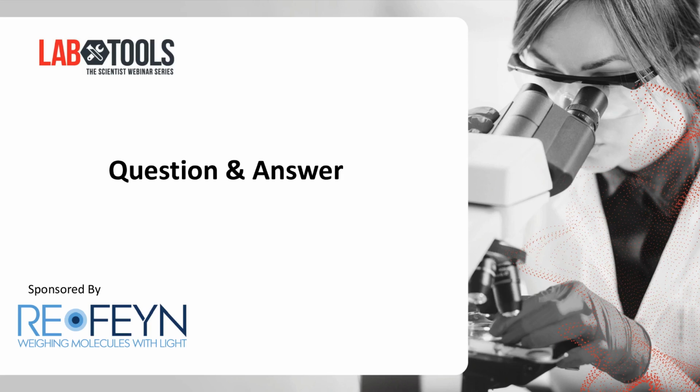Oh, yeah, that's a really excellent question. To be honest, going into this, that's kind of what we expected to happen. But we actually saw no evidence of a large aggregate species. What I didn't have time to mention is that if you look at some of the mass histograms for some of our antibodies, we actually see a small population that's about double the masses that I was describing, and those populations correspond to one or more antibodies binding two spike trimers. But we really didn't see any evidence of large aggregate species, at least in our experimental design. We were quite interested in that as well, but we saw no evidence for it, at least with the antibodies that we studied.